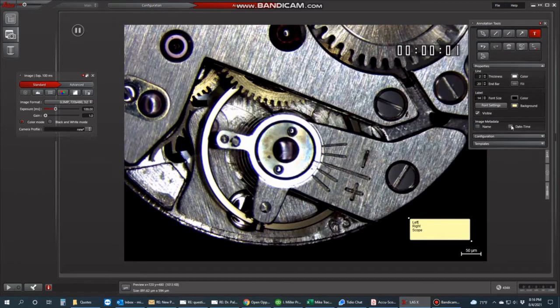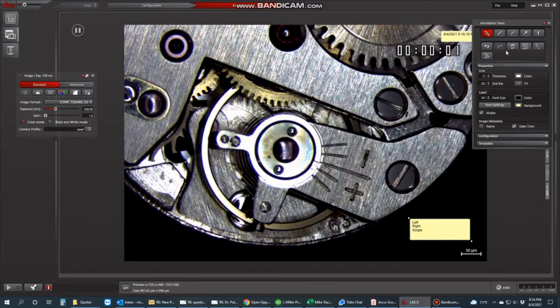Also, I know you like to add the date and time. In order to have the date and time show up, you also need to be in your selection tool. So if you see here, when I go to my text tool, that date and time went away. Just know that if this checkbox is here, it still has the date and time shown. You have to go to the selection tool, and now it's there. Here, we're happy with this. We like our layout. We can now save this as a template.